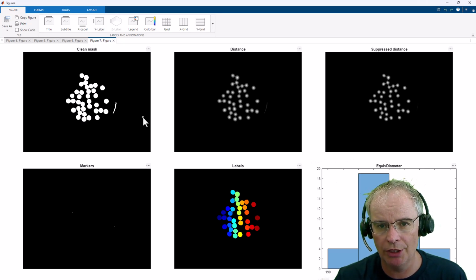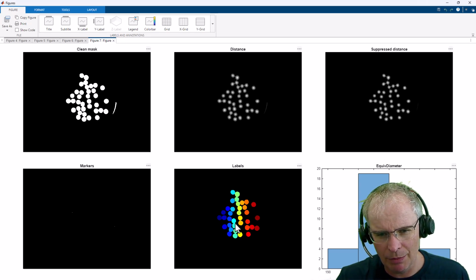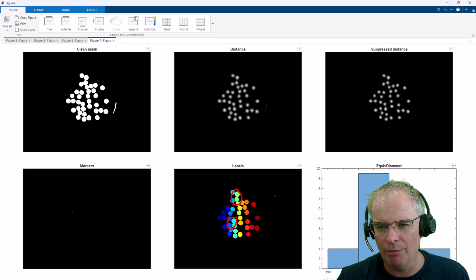So we're using a watershed bounded distance model in this case, and we can see that the distance calculations bounded from the center of the circle and looking for the connected regions are matching up quite well. And then we can suppress to get some of the noise out of it, and we end up with the labels as we're seeing here. It's probably not perfect. I don't think it's really separated out these chocolates and these chocolates. We can go in and tune that model a bit further to get into those details.